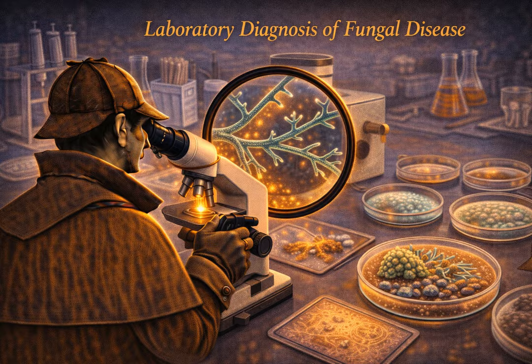Next up is the Giemsa stain. This one seems to have a very specific, almost niche application. I call this the intracellular hunter. Very specific. Giemsa doesn't stain the outer fungal cell wall particularly well. It stains the internal structures, the cytoplasm, and the nucleus. It is particularly good at showing you things that are hiding inside the host's own cells.